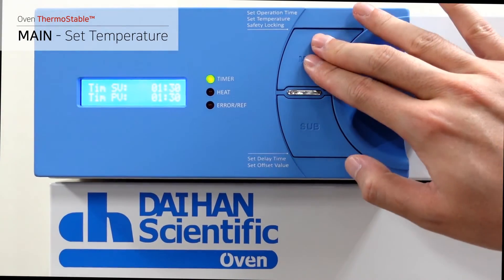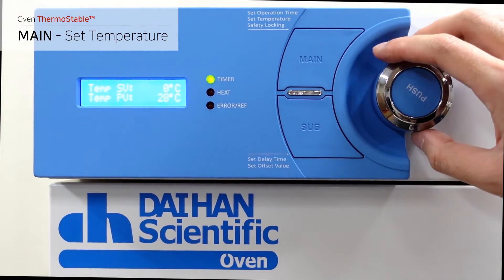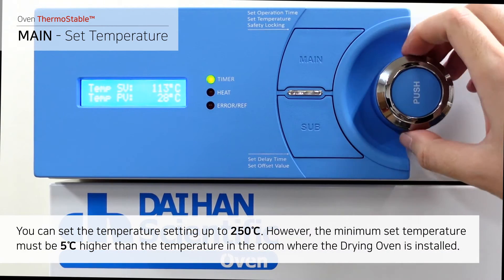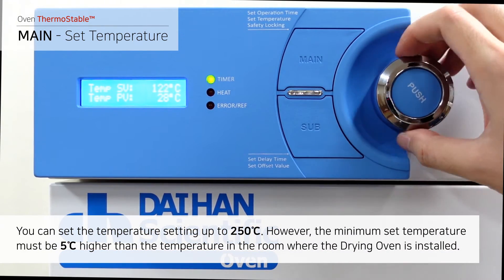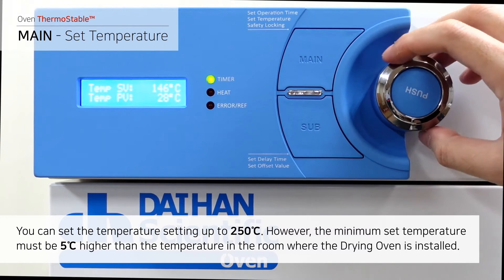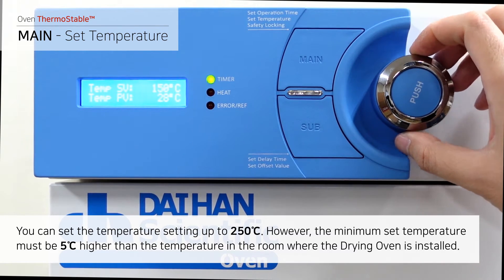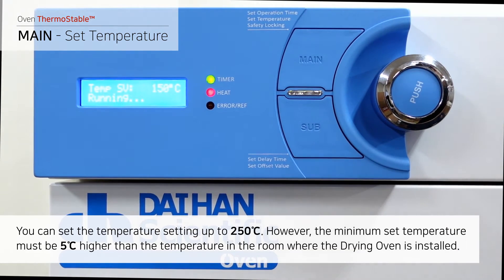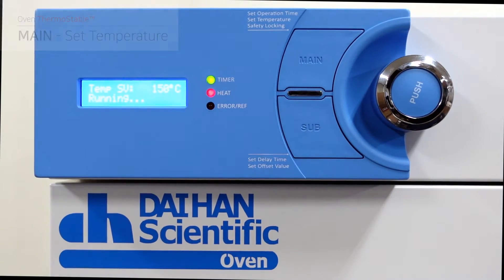Once you've finished the timer setting, press the main button to enter the temperature setting mode. You can set the temperature up to 250 degrees Celsius. However, the minimum set temperature must be 5 degrees Celsius higher than the room temperature where the drying oven is installed. Press the push button, the heating operation will start, and the heat LED will turn on.